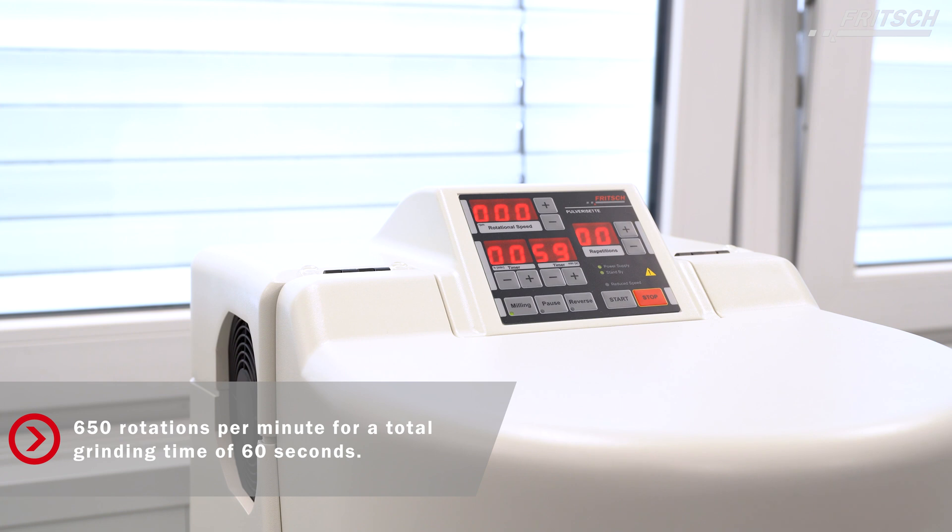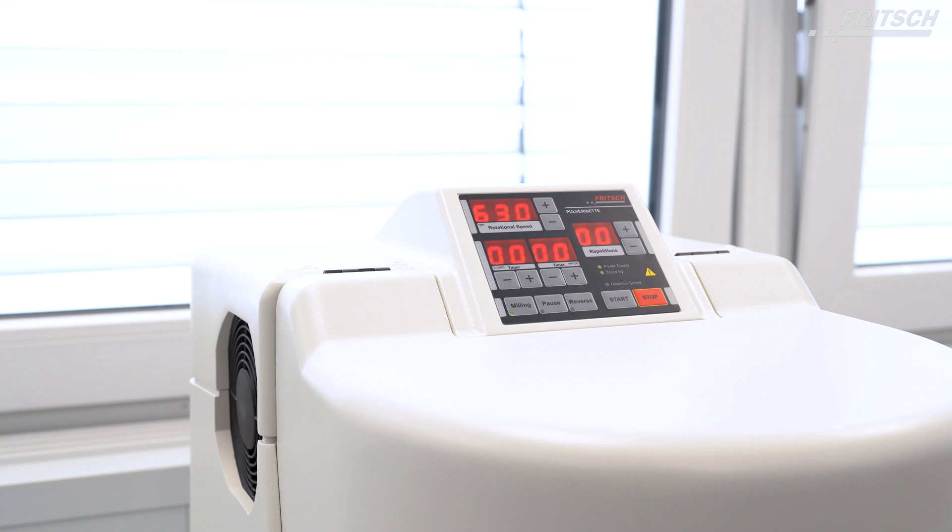In the first grinding step, the instrument is now set to run with 650 rotations per minute for 60 seconds.